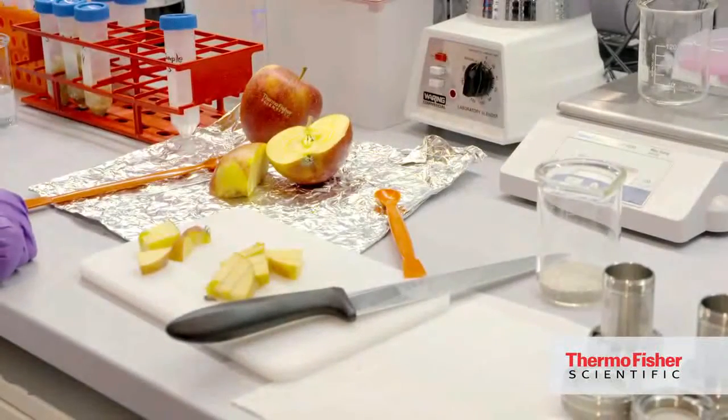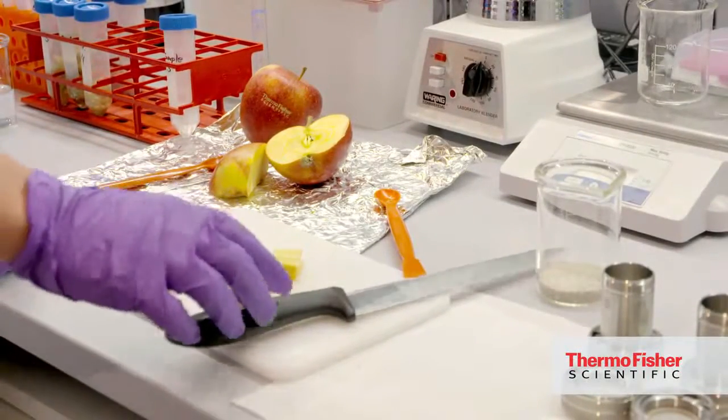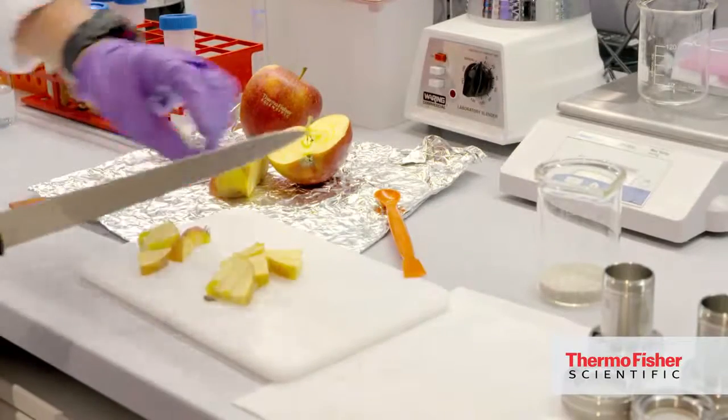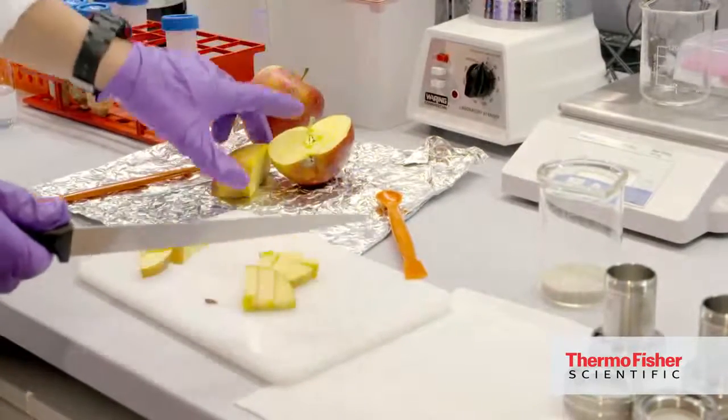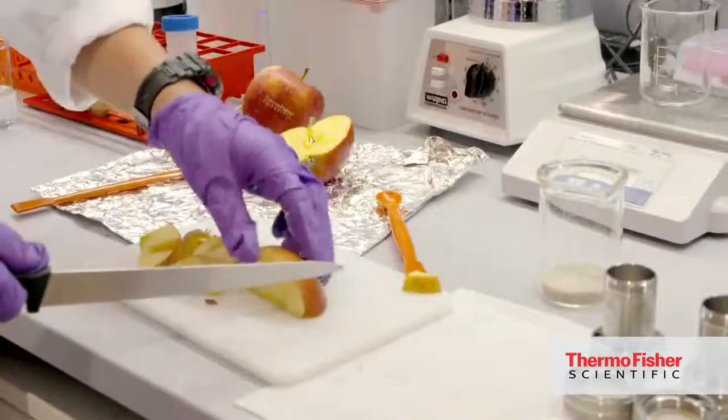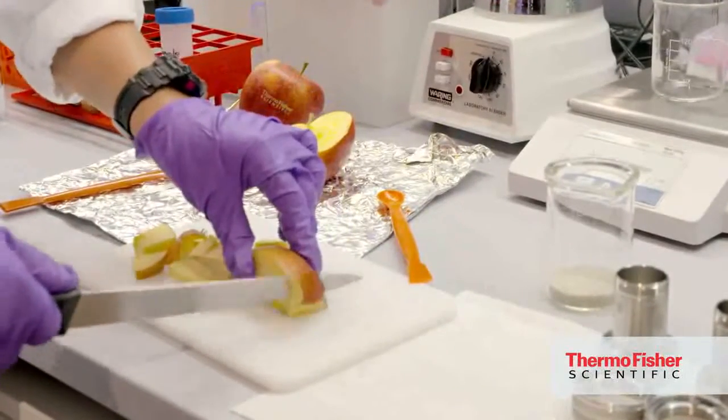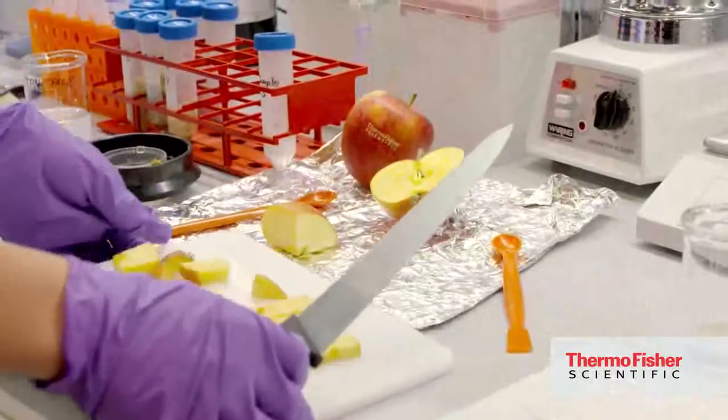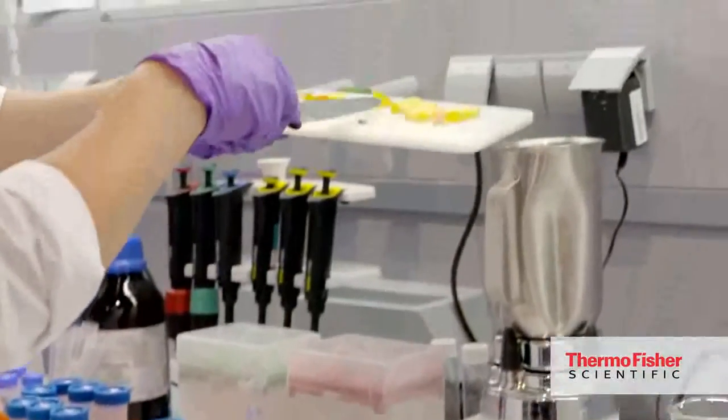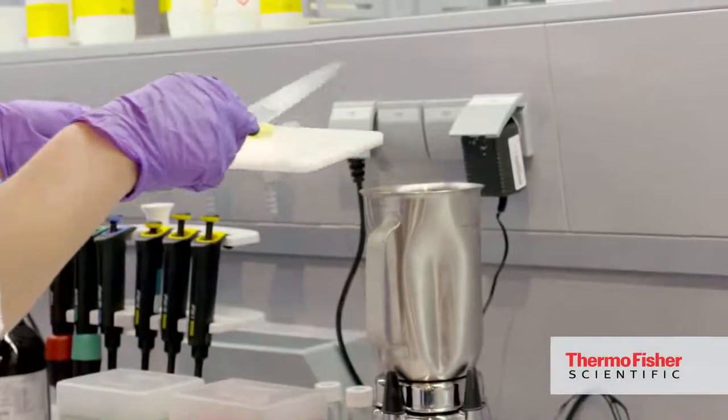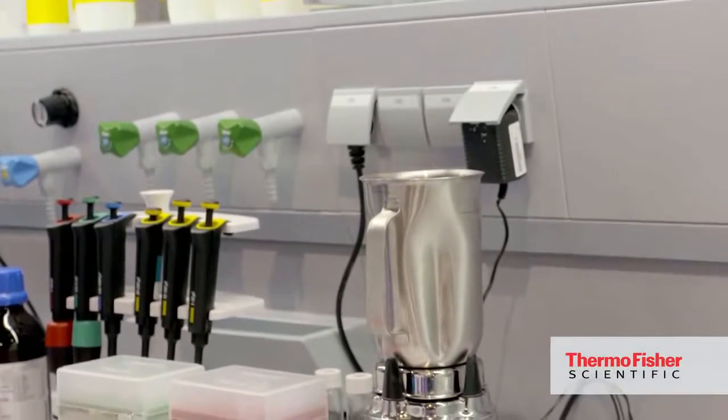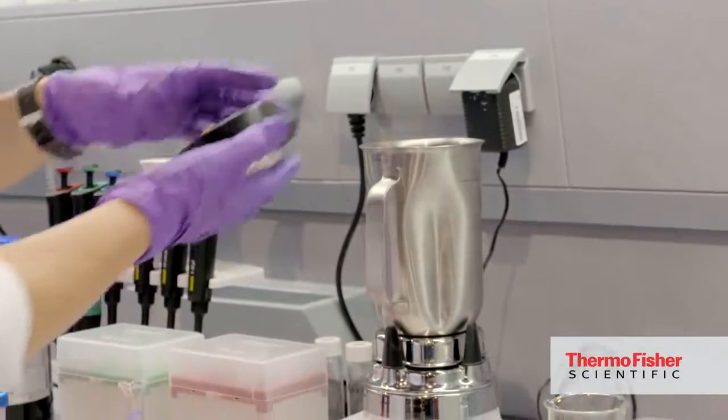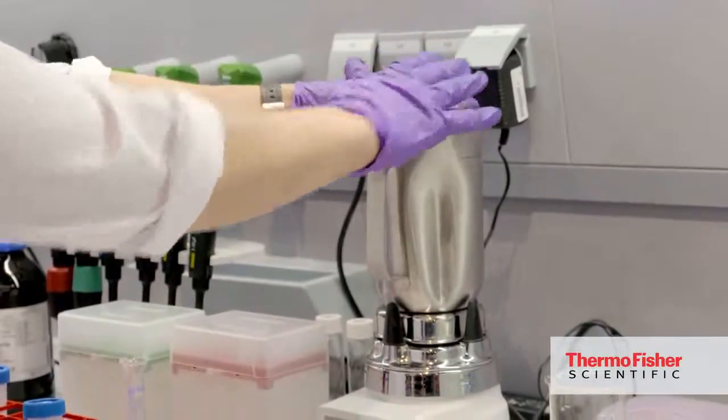So we are doing pesticide analysis and for that first of all we take an apple, the sample, and we chop it making it ready for the homogenization. So the chopped sample will be put into the blender. This is like a normal kitchen blender, and like at home we just put it on.